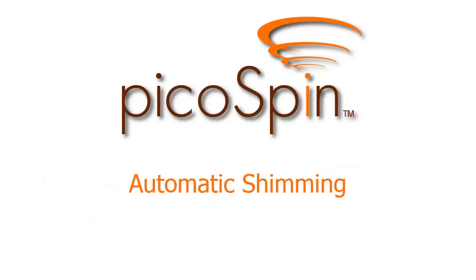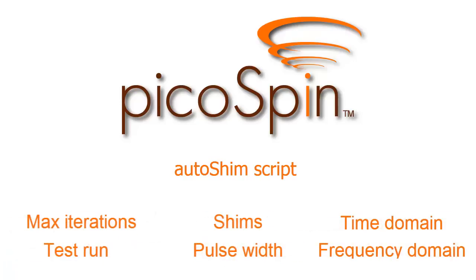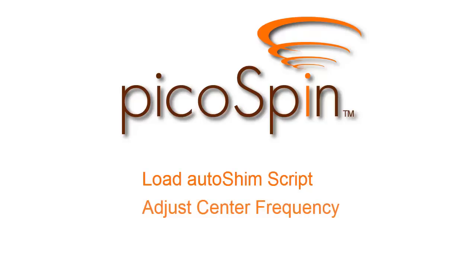In this video, we explored the topic of shimming using the AutoShim script. We described various parameters, their meaning and optimum values for shimming. We examined the text displayed in the scrolling text window, as well as the time and frequency domain plots. After you're familiar with your system, you'll find that keeping your unit in good shim is very simple. You just load the AutoShim script, adjust the center frequency, and hit the Start Run button.